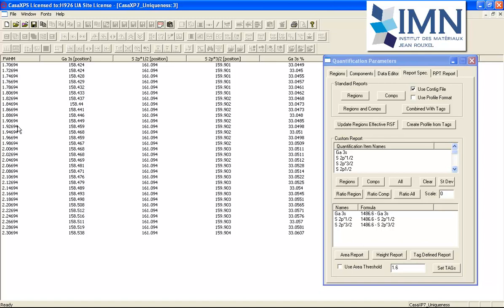From the uniqueness plot, we can see that there is a range of values between about 1.9 and 2.0 where we cannot differentiate on the basis of chi-square which would be the most appropriate full width half maximum to choose for this Gallium 3s peak.